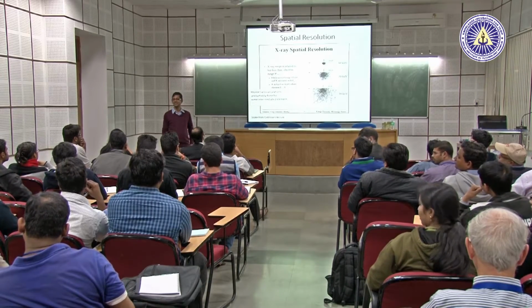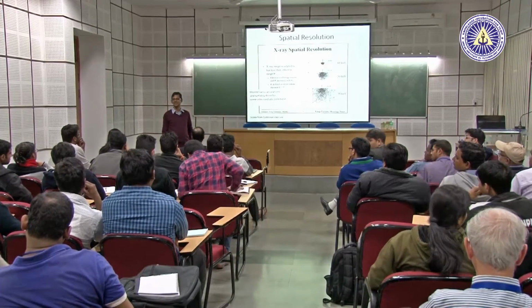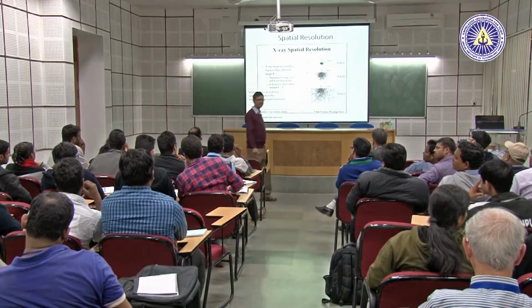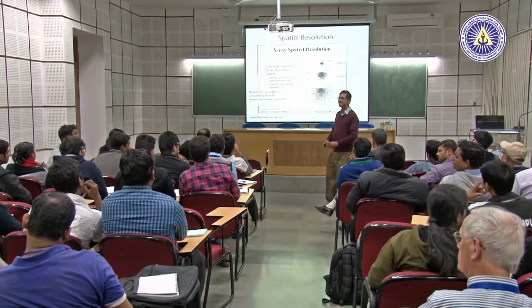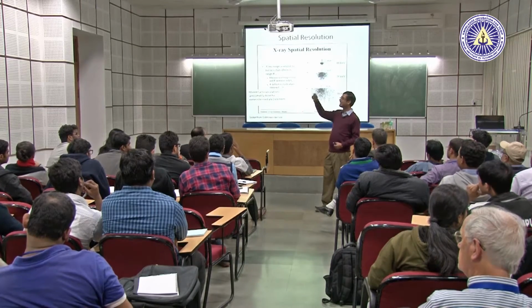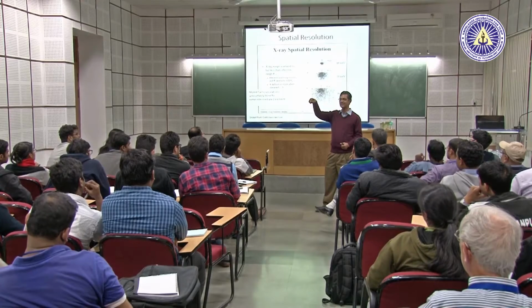In the case of EDS, you told us about K alpha lines. Meaning from the inner shell the electron is knocked out. Yeah. So the incoming electron will knock out the inner shell electron. Yes. Then the outer shell electron will jump to the K shell. That's why you call them K lines.